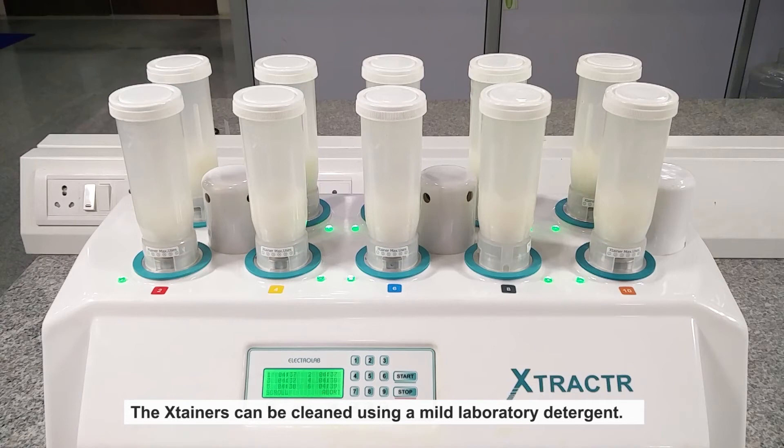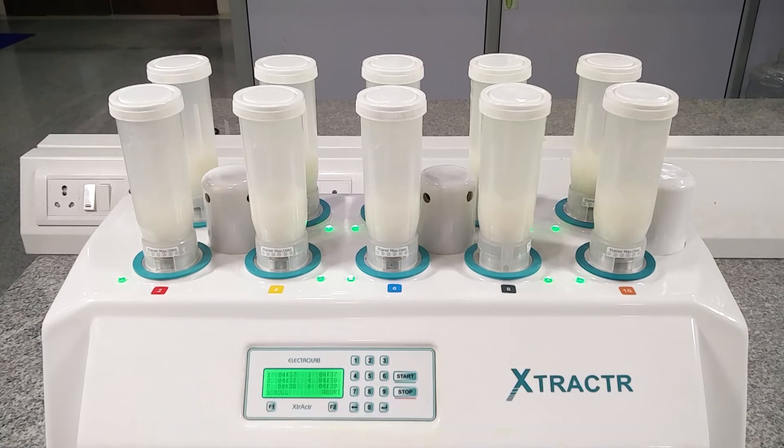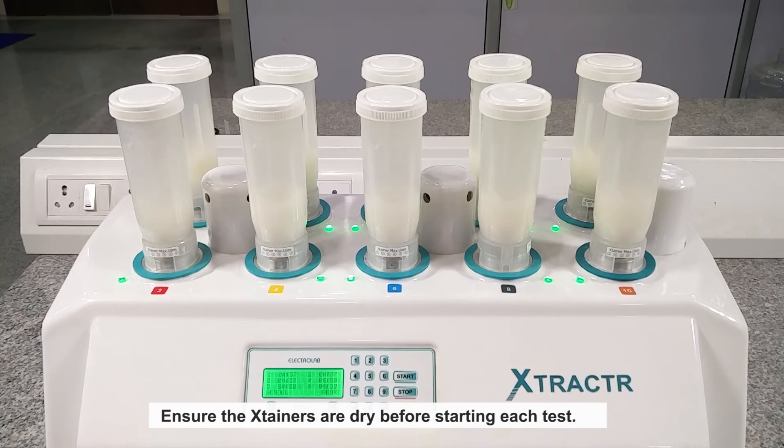The Extainers can be cleaned using a mild laboratory detergent and rinsing thoroughly with water. Ensure the Extainers are dry before starting each test.